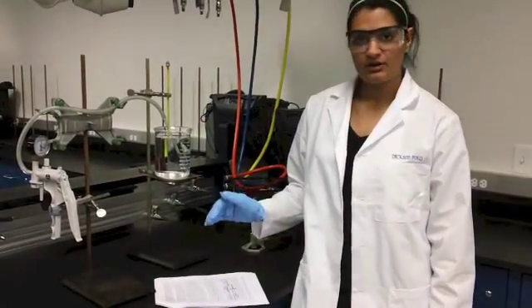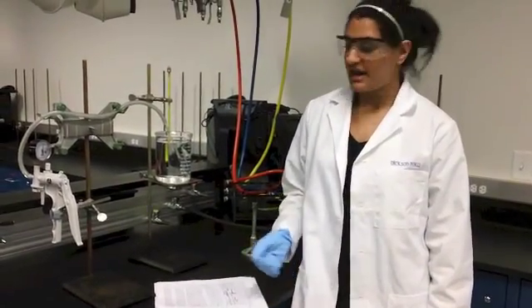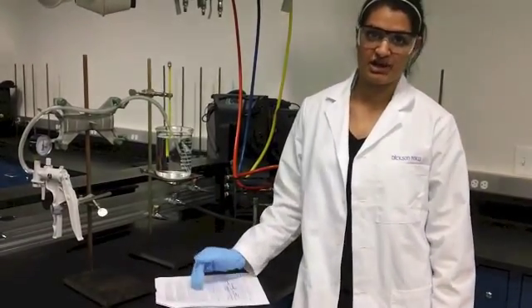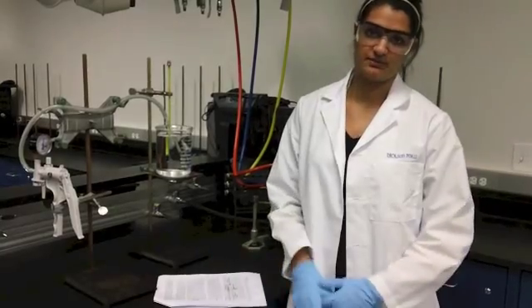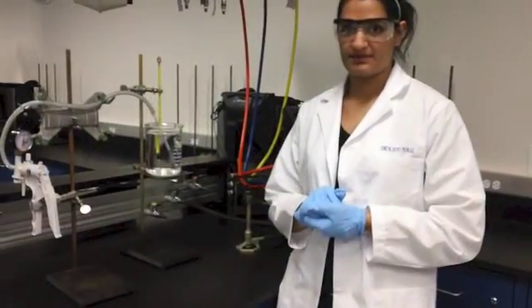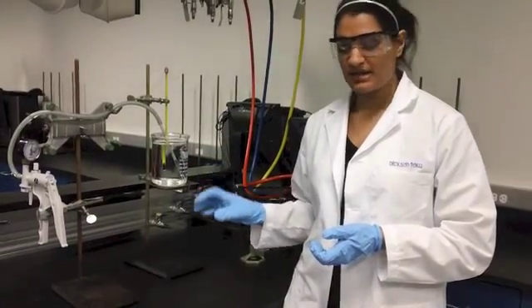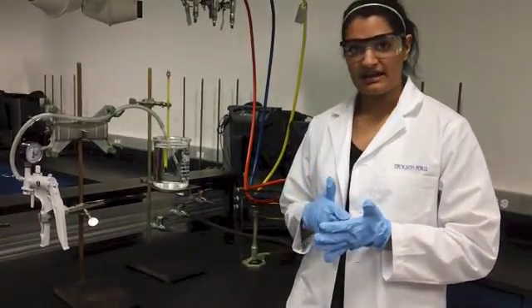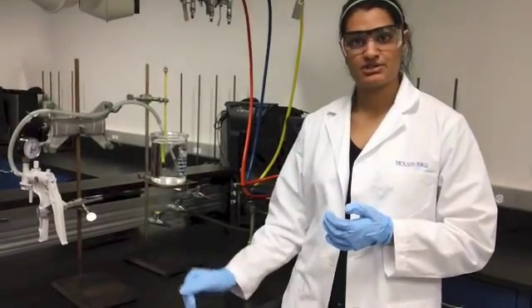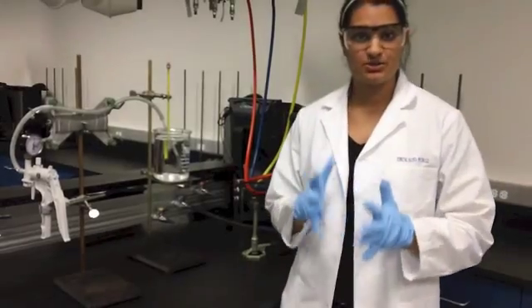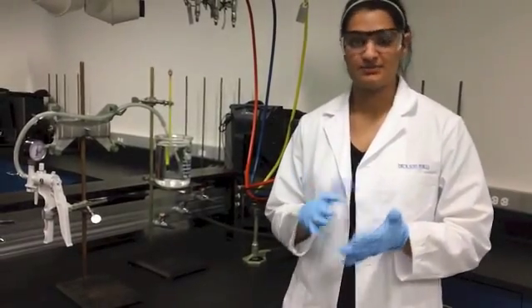You'll then heat the water bath using a Bunsen burner and repeat the same process at six different measurements of temperature and record the pressures as well. You will then cool the water bath by adding ice to it. Repeat this process again at six different data points recording the temperature and the pressures. In the end, you'll have a total of 10 to 12 measurements of temperature and pressure.